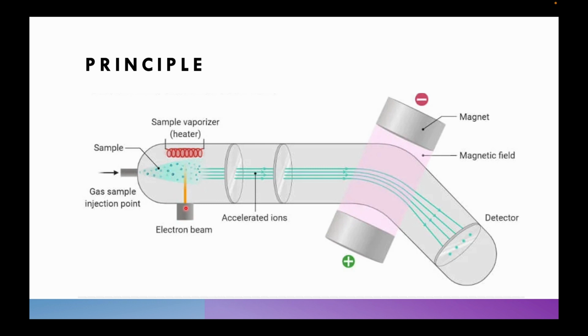So there are different types of ionization sources present: electron beam, electron ionization, chemical ionization. When they hit the sample, they release the electron and it becomes positively charged. And these positively charged ions are very important for the detection, because only then can they pass through the electric field. And through this beam they can generate different molecules.